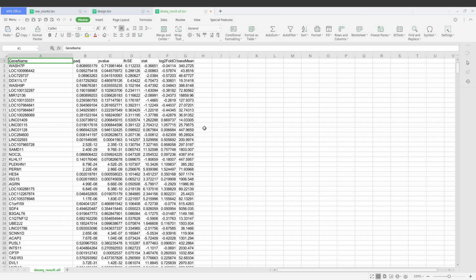All right. Now this has the result that DESeq2 has returned. But with the statistical analysis, we have these values, the PADJ value. I'll focus on this one here. The PADJ value can be used to filter and get the top genes, or the most significantly expressed genes. Let me just put it that way. So you can use PADJ value as a criterion. You can also include log2 fold change. For those criteria, you just have to look at the best practices and then decide.